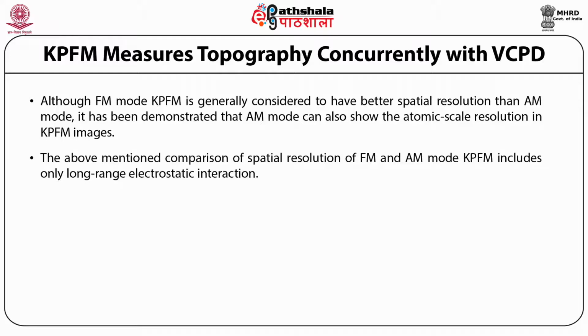The above mentioned comparison in earlier slides of spatial resolution of FM and AM mode KPFM includes only long-range electrostatic interaction. However, recent theoretical studies on the limitation of FM and AM mode KPFM suggested that the short-range interaction becomes more significant in atomic scale KPFM, and both FM and AM mode KPFM in the sub-nanometer regime have the same limitation in spatial resolution.